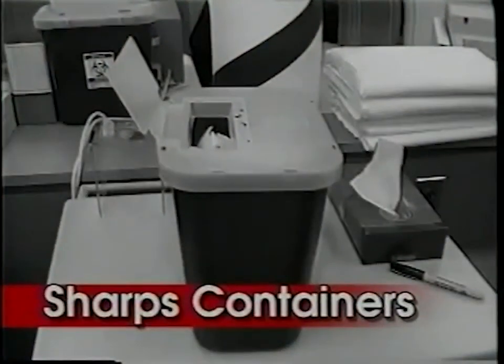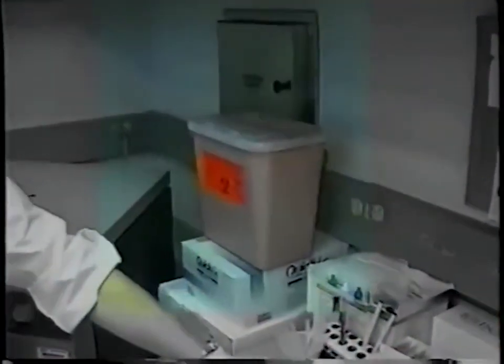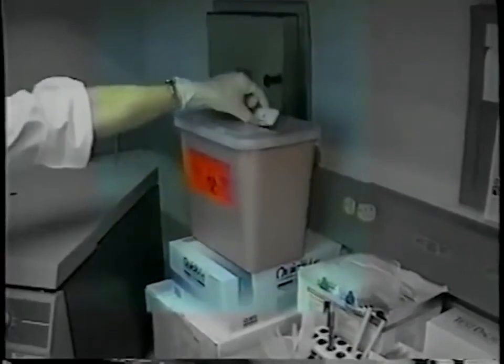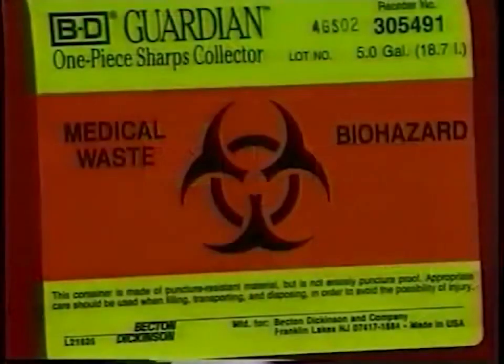Sharps must be segregated from all other waste and put directly into a sharps container. Sharps containers must be designed primarily for the containment of sharps. Sharps containers must be leak-resistant, rigid, and puncture-resistant. They must bear the appropriate phrase and the International Biological Hazard symbol.